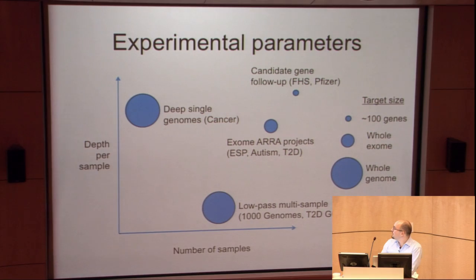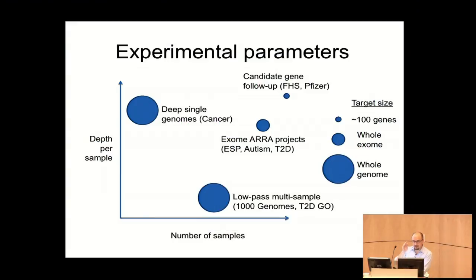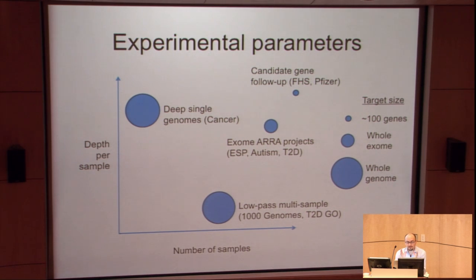Good. So, can you talk about the cluster and how many little fragments are in clusters? So a cluster is an individual read being, it's really, so the way these machines are working, you have a slide, and you've sort of bound your DNA molecule, your fragment, to the slide. And then you start to sequence on that. And the cluster is really an amplification of a single fragment that is being observed by the machine.